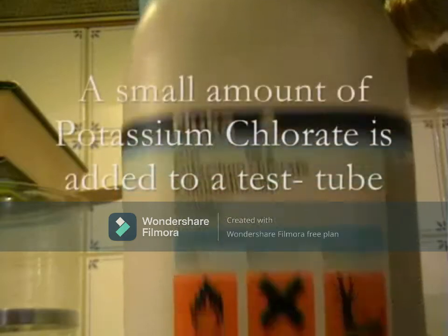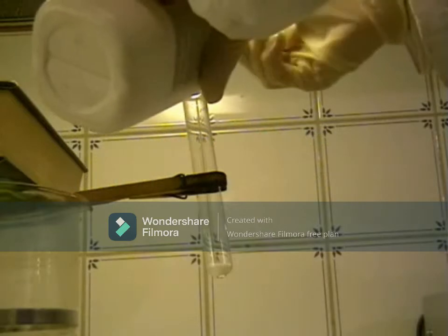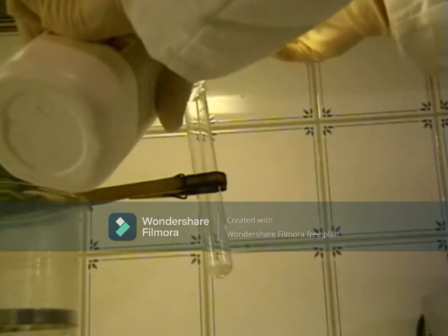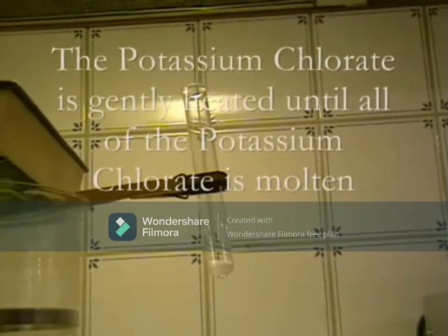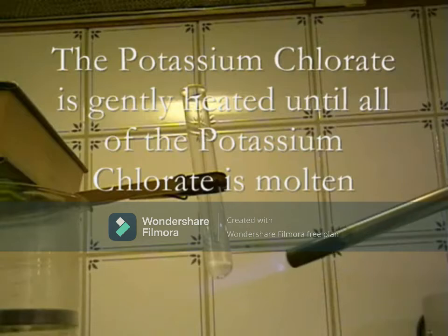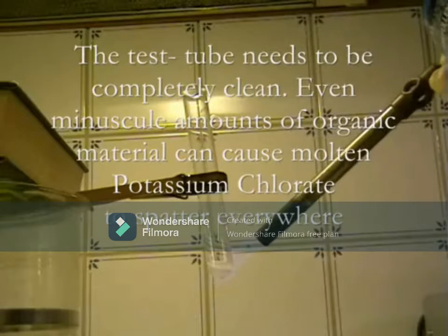Now, the next experiment is an experiment that you shouldn't try because it's very dangerous. It is the decomposition of sugar in a gummy bear. You need to have this chemical, potassium chlorate, in order to carry out the experiment. So first, you heat until it melts or forms the molten state. It takes a while for potassium chlorate to melt. And make sure it's clean so that there will be no organic substances present.